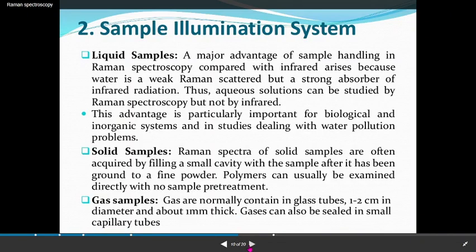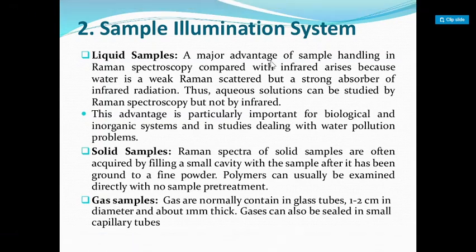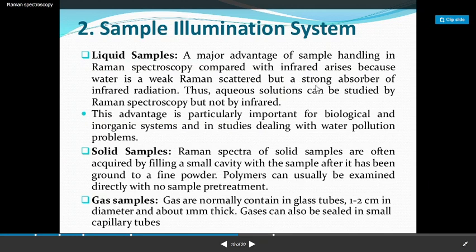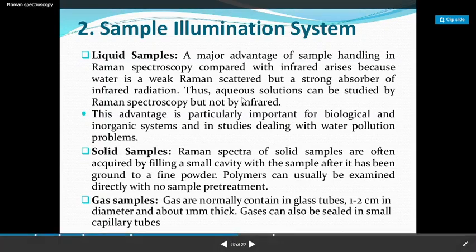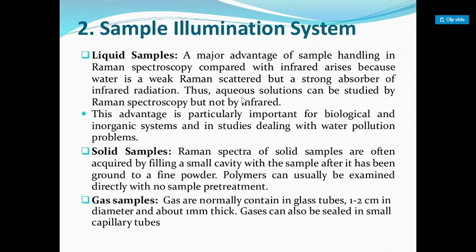Then sample illumination system. Liquid samples. A major advantage of sample handling in Raman spectroscopy compared with infrared arises because water is a weak Raman scatterer but a strong absorber of infrared radiation. Thus, aqueous solutions can be studied by Raman spectroscopy but not by infrared. This advantage is particularly important for biological and inorganic systems and in studies dealing with water pollution problems.